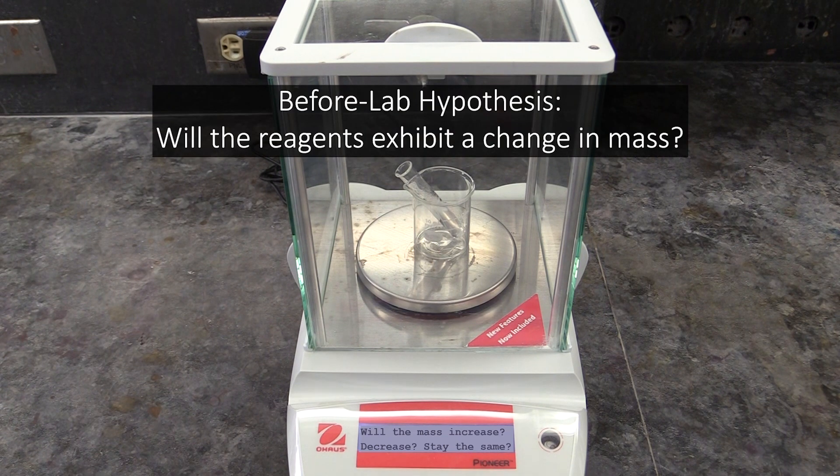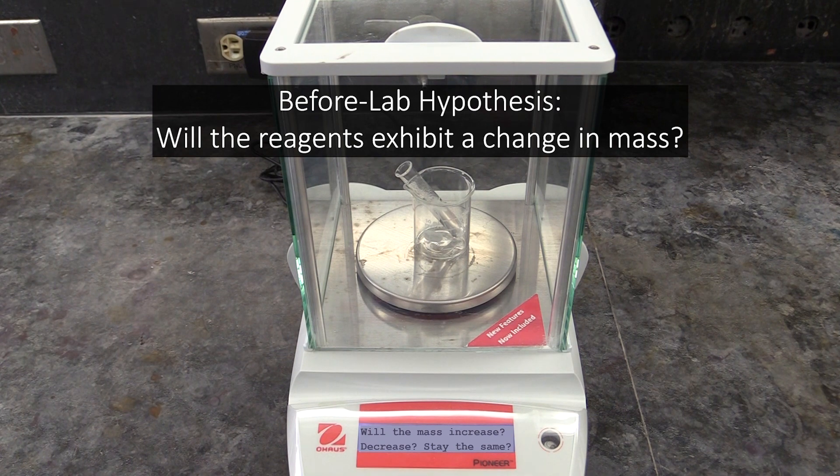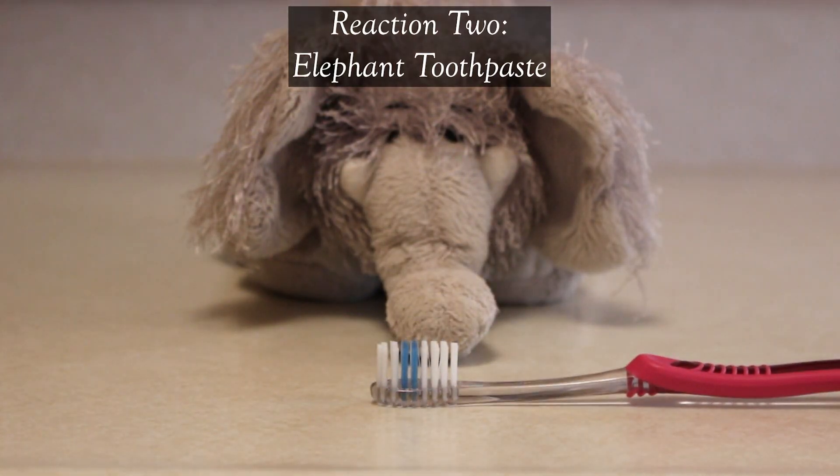Before you come to lab, you must hypothesize whether or not you will observe a change in mass as the reaction takes place. For your second gas-forming reaction, you will make elephant toothpaste.